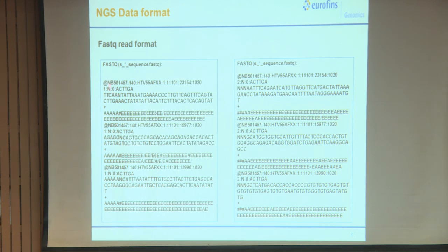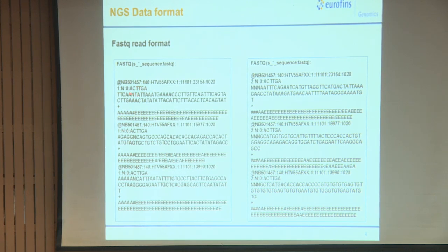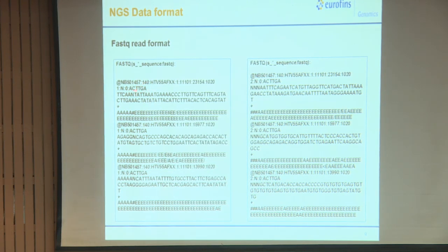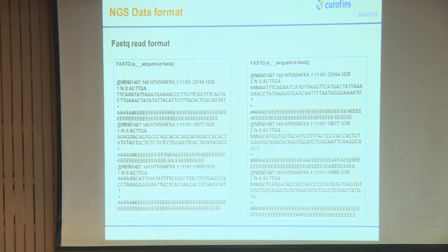The second thing is the 6 base pair barcode, which is written here. You can see it is identical for all, because I have taken reads from only one file. So, a sample will have identical barcodes, and you can see the R2 also having the same barcodes. Based on this we can segregate the samples from a run.